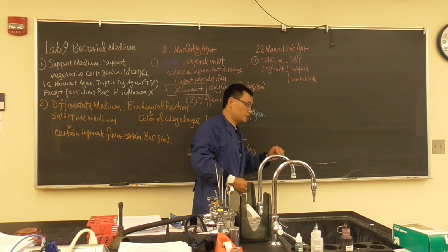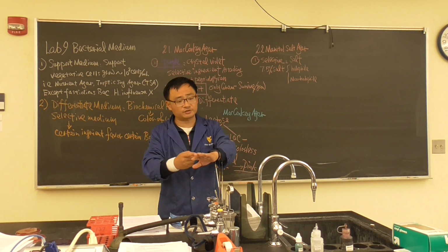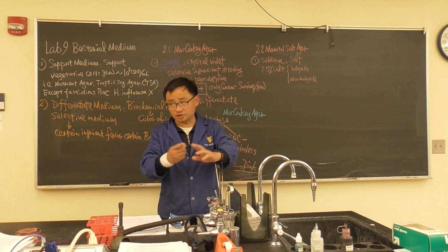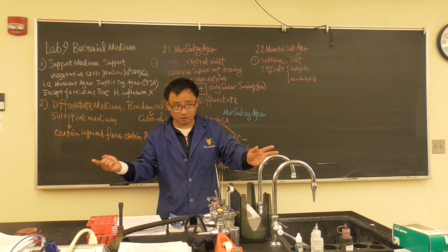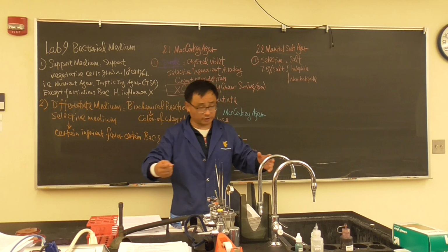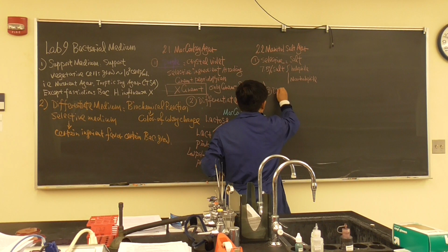And another reason we said lots of times why Staphylococcus will grow on the skin surface, it's a halophile, and skin surface will generate some salt. It's also our natural defense system of the body. So that's a salt. Second, what is the differentiated agent?